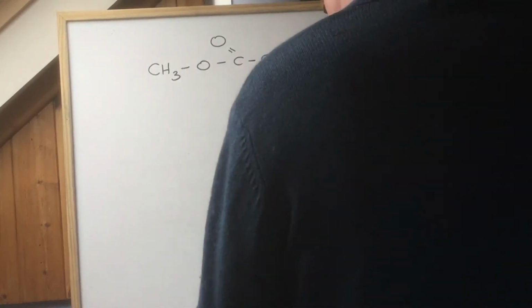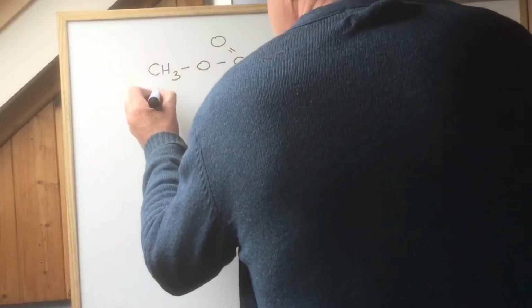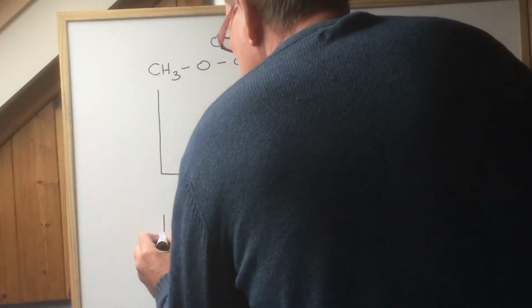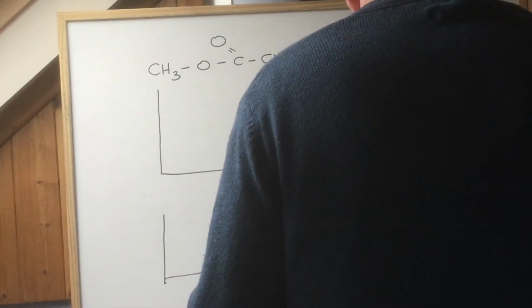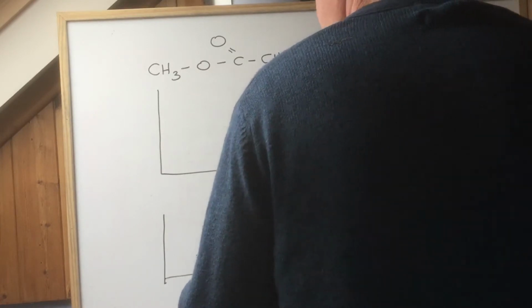All right. Now, first of all, I'm going to do 2 spectra. 1, 2. This is whatever it is on this scale. I think I need to go up to about 6.